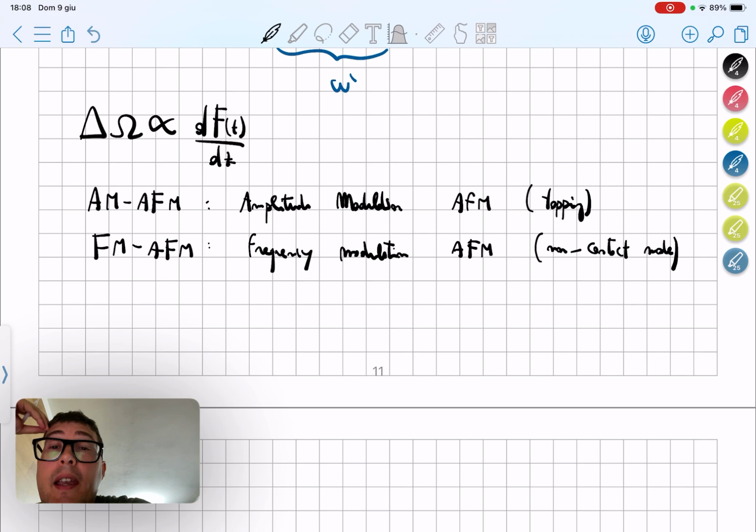And we are actually reading the amplitude, the vibration of the cantilever, on the photodiode, and we set up an amplitude. We decide on a specific amplitude to use.